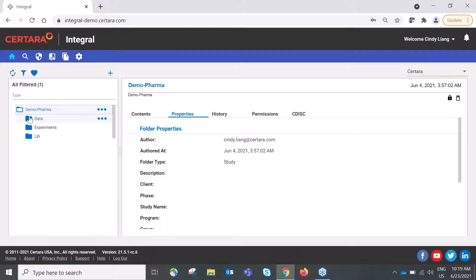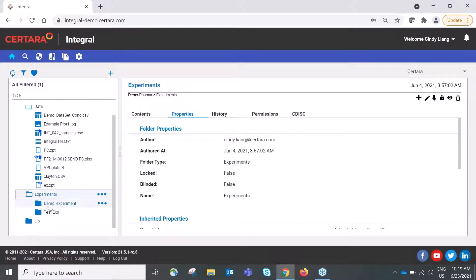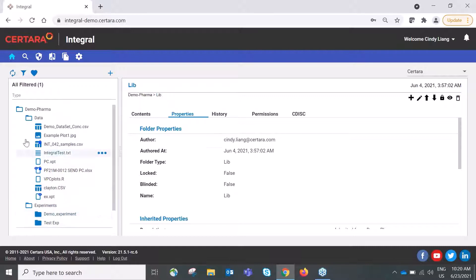Clicking on a favorite folder and opening it reveals a system-configured folder structure with Data, Experiments, and Library as subfolders. Data is where source data is stored, Experiments refers to analyses run using that source data, and Library is used to store study protocols or references.